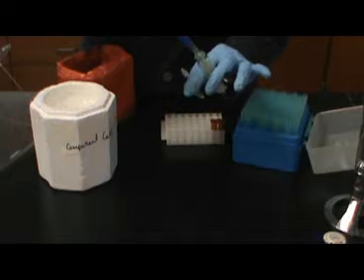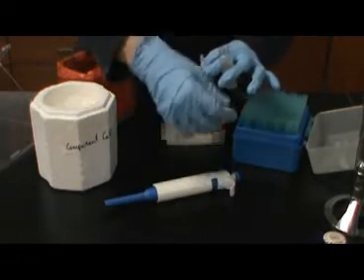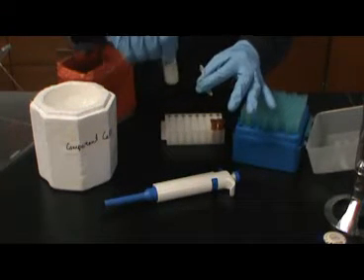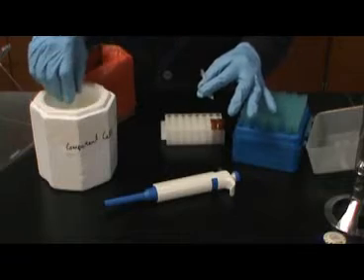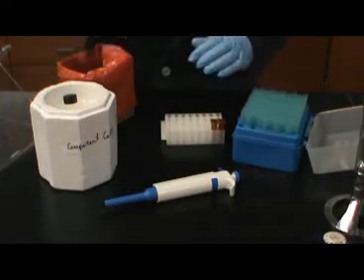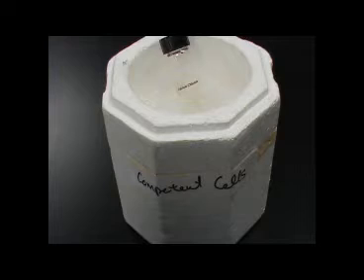Calcium chloride will make the E. coli cells competent. Competent cells are cells that are ready for the uptake of DNA or plasmid DNA. In transformation, bacterial cells will transform or take in extraneous DNA found in the environment. In this case, we are providing the cells with plasmid pUC18. The E. coli cells will need to sit on ice for approximately 15 to 20 minutes prior to use.